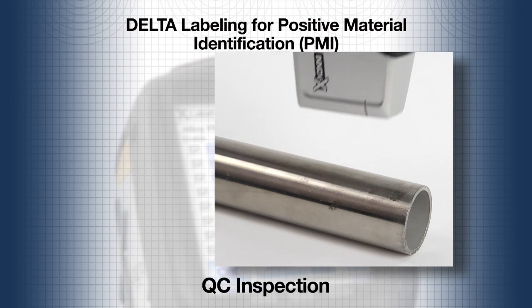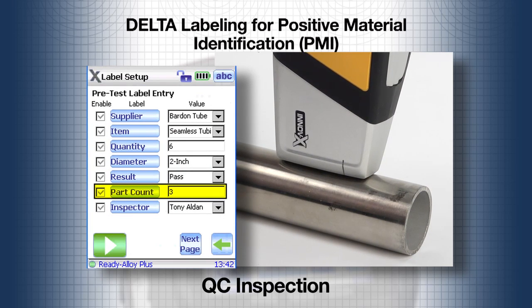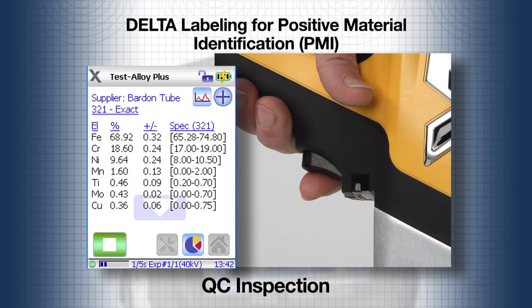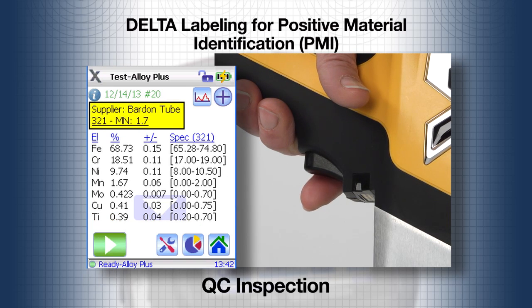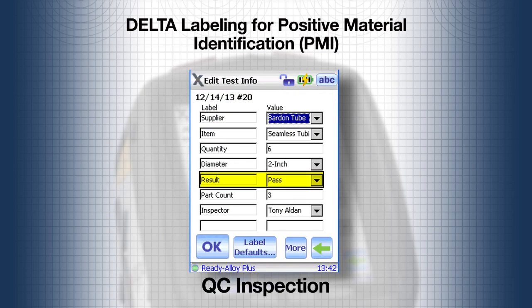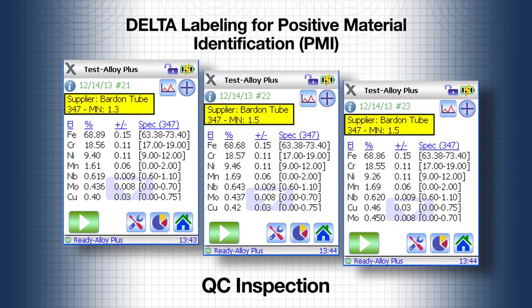The third tube test starts like the previous two, with the label window appearing and the part count now at 3. Pull the trigger and the test starts. The results show that the tubing is 321 grade, not the expected 347. Tap the info icon to open the edit test info window and change the result to fail grade. The fourth, fifth, and sixth tubes are all 347 grade.